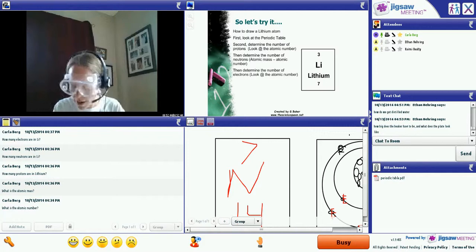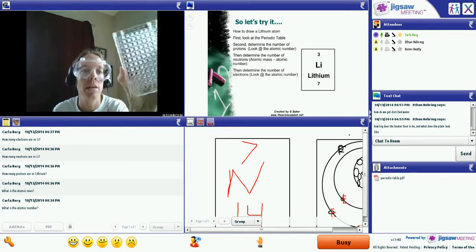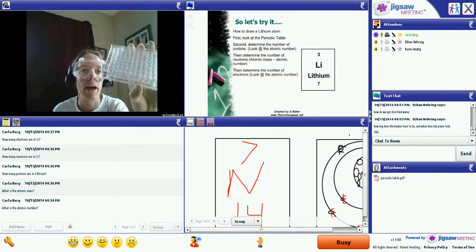Make sure your safety goggles are on, and just click yes when you are ready to go. The beaker should be the 50 milliliter beaker. It's the small glass one that's in your lab. And the 96 well plate is the well plate with the smallest holes in it that you have.